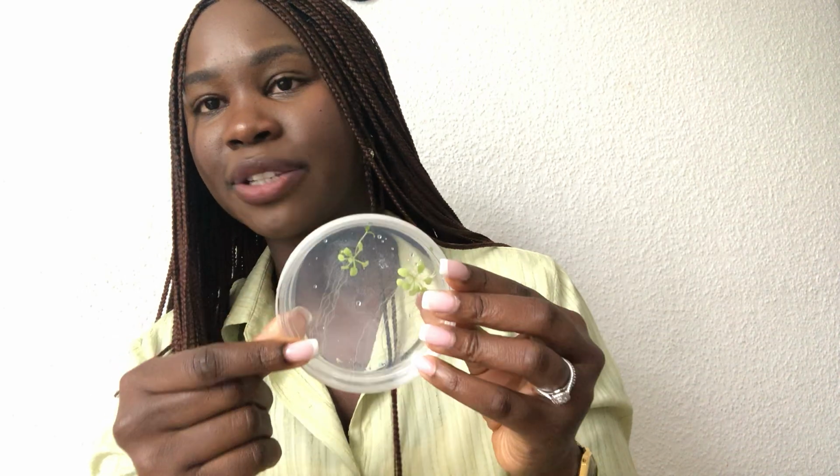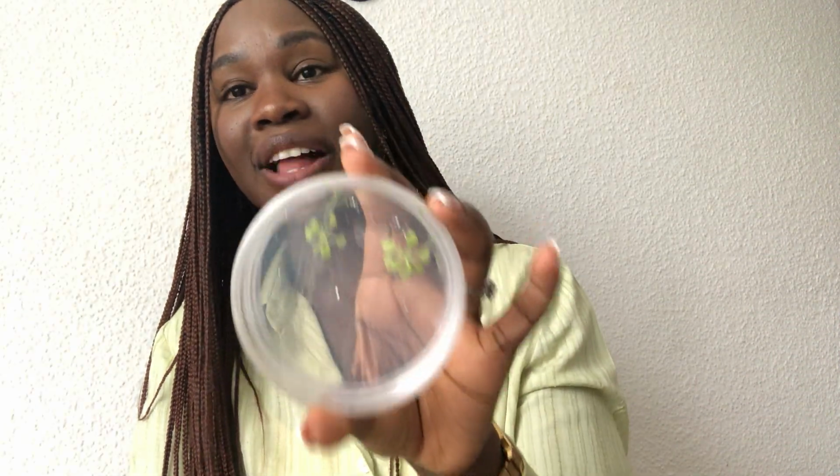So in our context, axenic is the fact that we only have one pathogen inside here, which will then be the plant parasitic nematode, right? Not even two parasitic nematodes, but just one. Per time, we're always working with either only Heterodera schachtii or only Meloidogyne incognita. So this is why it's very, very important for us to work under sterile conditions.